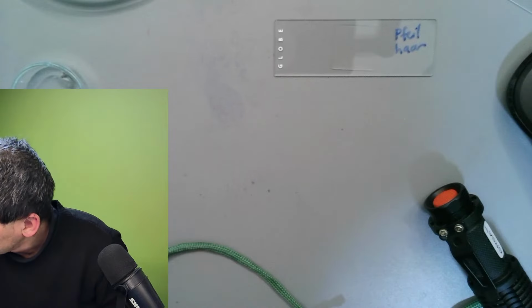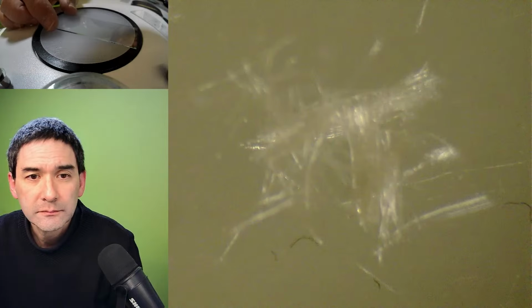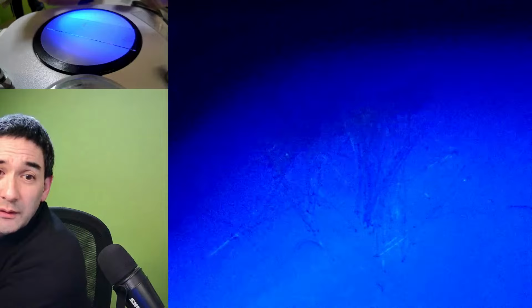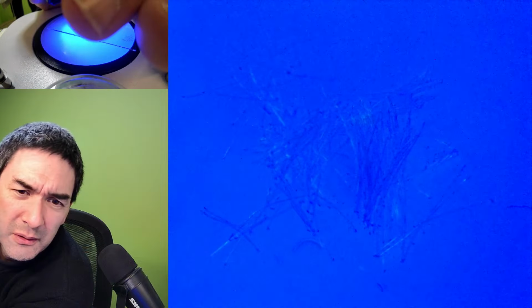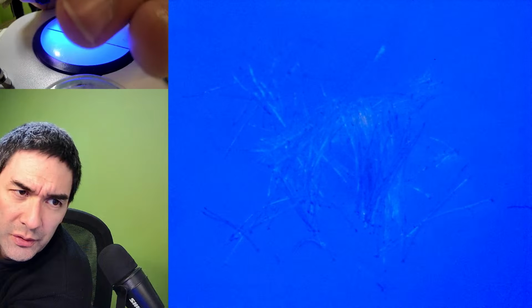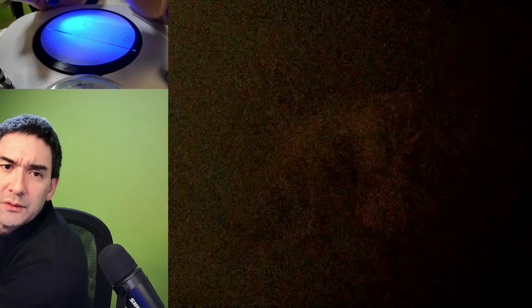Here it is. I need to switch over again to the stereo view. Again, it's not entirely dark in my room, but I don't know, maybe a little bit. You know, it could be just also the reflection. No, but real fluorescent light should be much brighter.